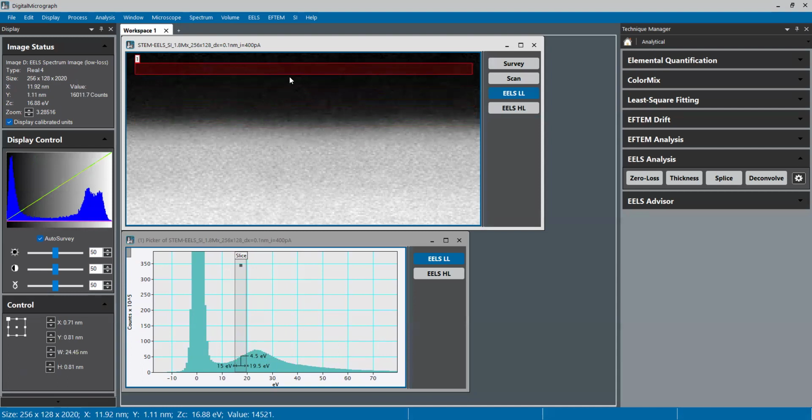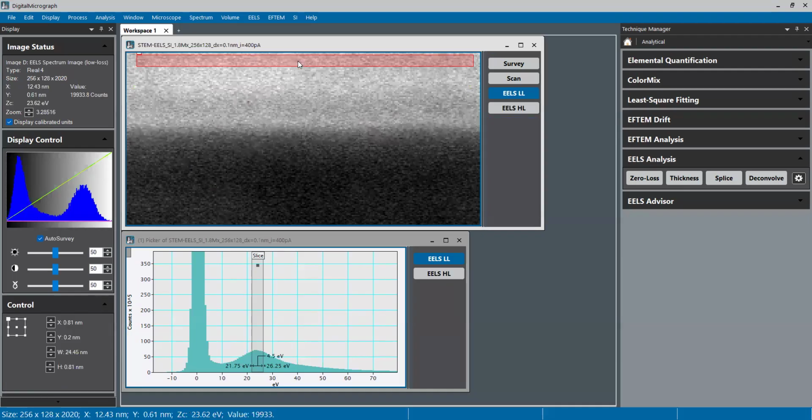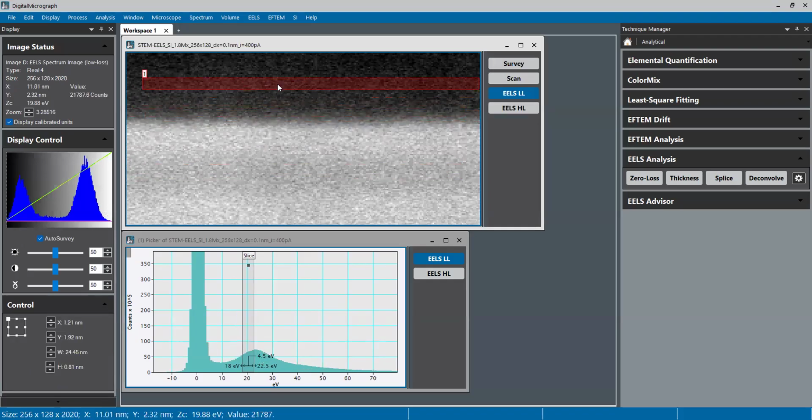Okay, so I don't see anything up here, but I see when I'm into the epi layers and the silicon substrate, okay? Same thing, if I move this back over here, I see bright up here because that's where I have the carbon, and there's a shift with the silicon dioxide. The silicon dioxide is right about there, but there's also silicon there as well. So yes, this is a way to see where your Plasmon signals are coming from as well.